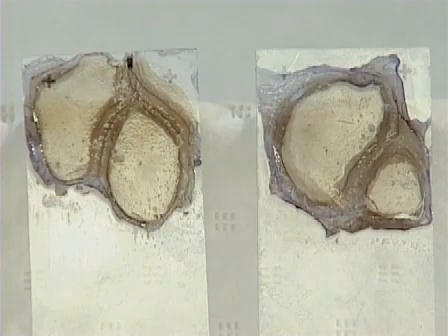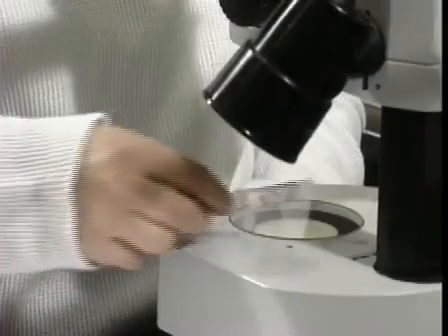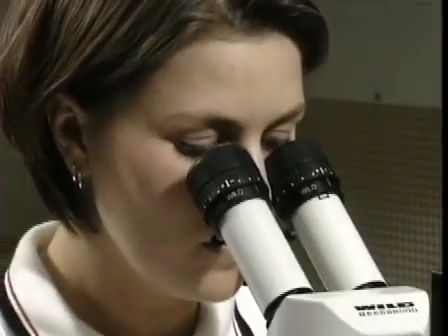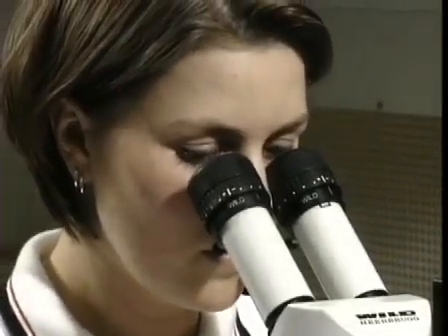Allow the specimen to dry in air. Do not mount with a cover glass. The quantification of the incidence of blood vessels in individual mesenteric windows is done using computer-aided morphometric microscopy.